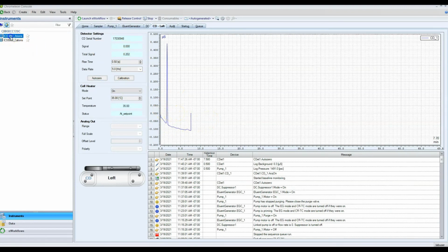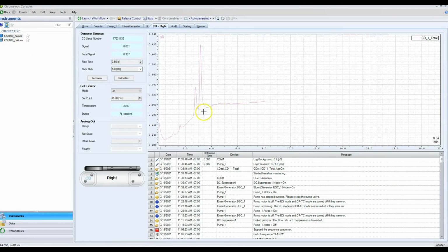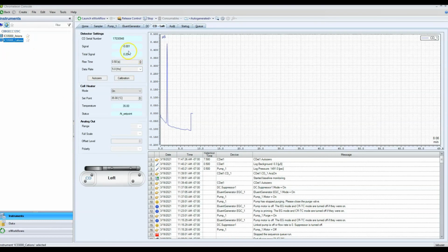That's what that means. So the anion side, almost the same thing is happening right now. It looks like it's flattening out pretty good though. It's not changing too much right here. We'll give it a little bit more time either way, just to make sure that it's good. And once those are flattened out, actually this one looks like it has completely stopped changing, so that one's pretty ready. And this one is changing real slow anyways. Oh, that wasn't a peak. That was just me auto-zeroing it. All right, so it looks like they're both ready to run.